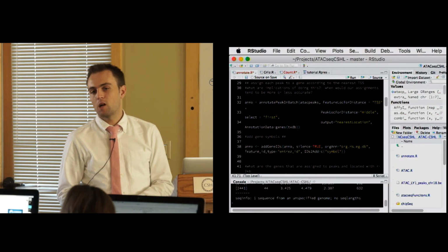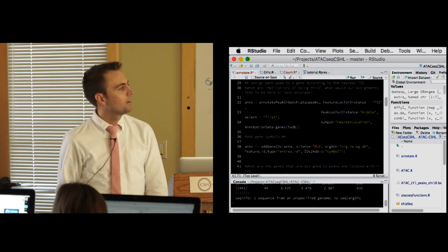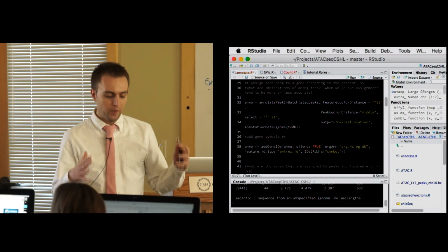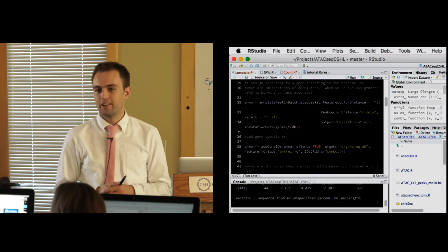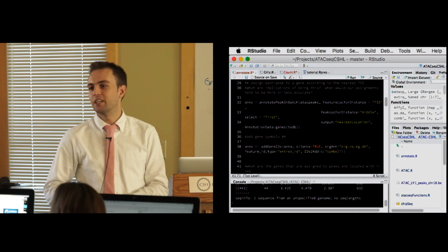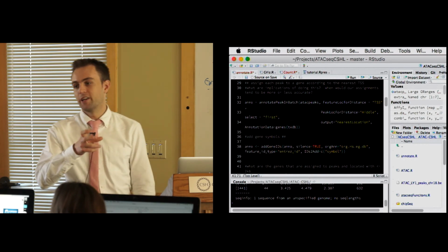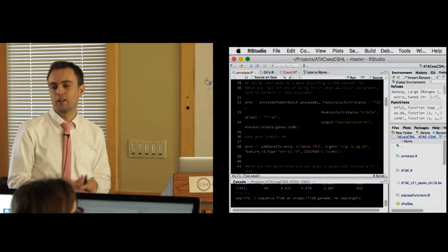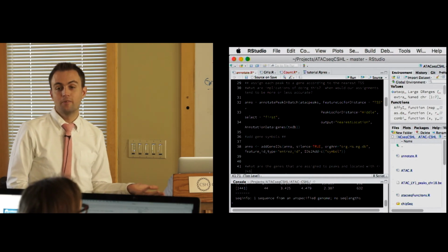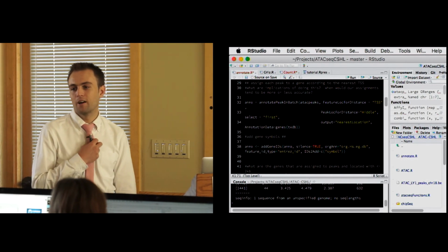At promoters, it's probably pretty reliable. We can look at what some of the ATAC-seq data looks like later, but if you see a big region of open chromatin that's 10 base pairs away from the start of a gene, most likely it's the regulatory machinery regulating transcription there. But enhancers seem more and more like the more important regions to focus on.